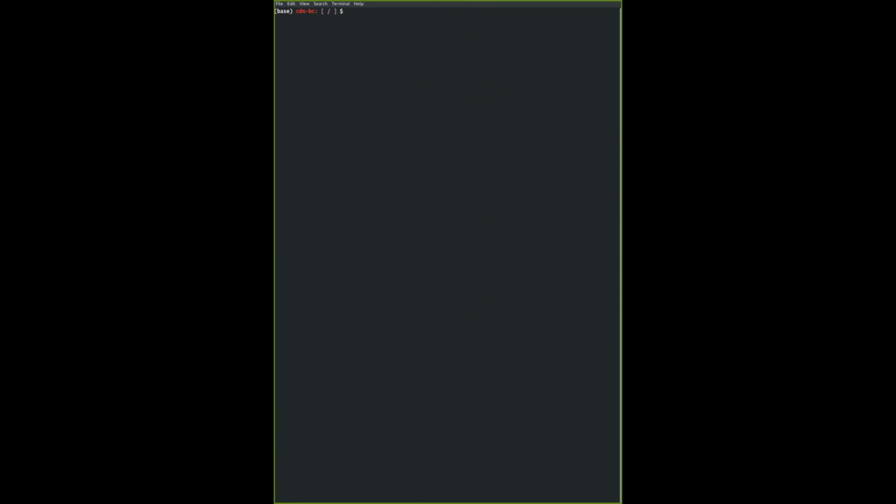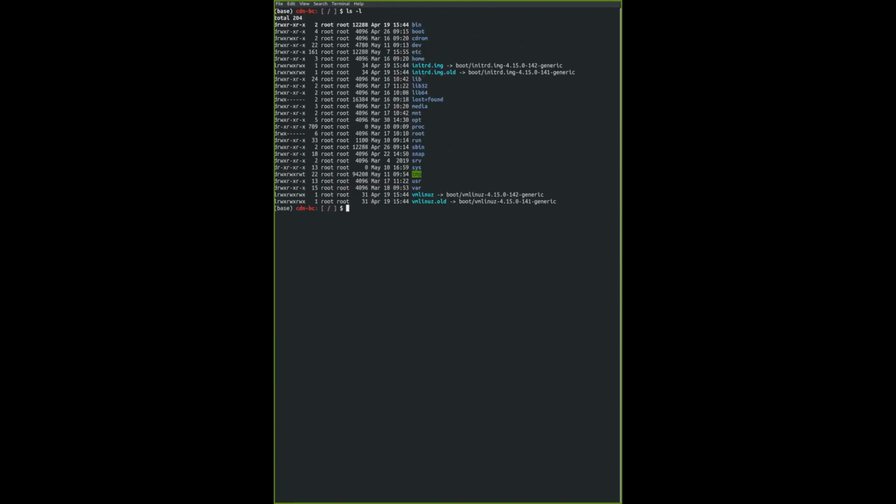Cool. We can also provide other directories, so we don't really need to list files in the current working directory. We can specify other directories to list the containing files and folders. So for example, now I'm going to list the files I have in root again, and you can see that there are a couple of folders here. You have bin, which contains all the codes and binaries that execute. Even ls is actually a code or a script within bin.